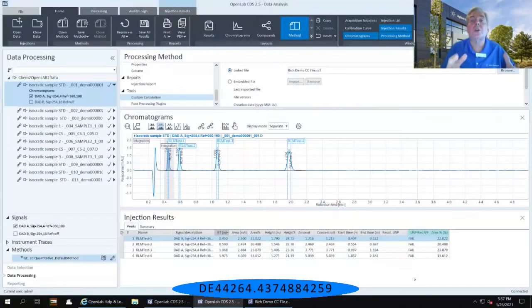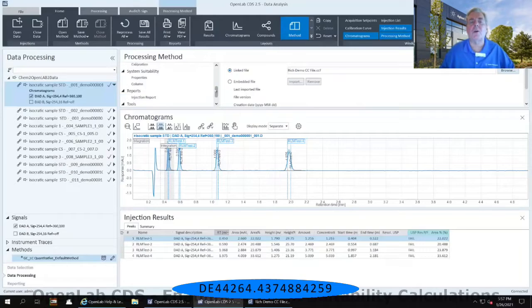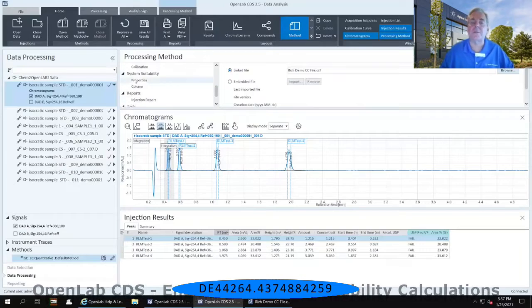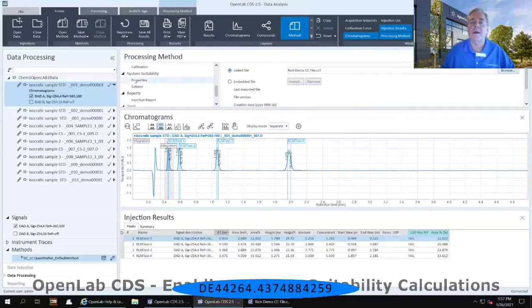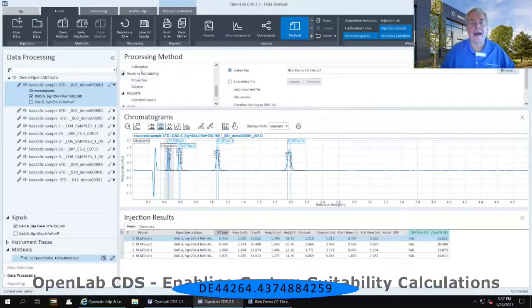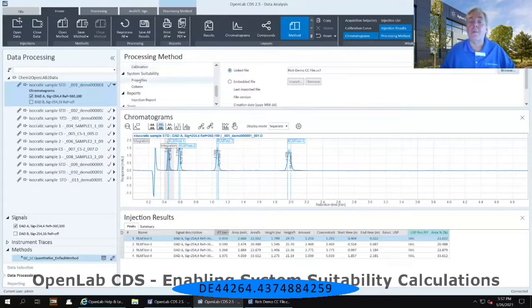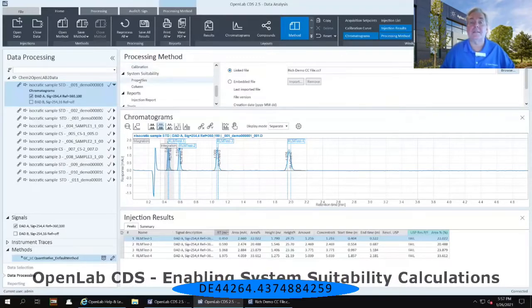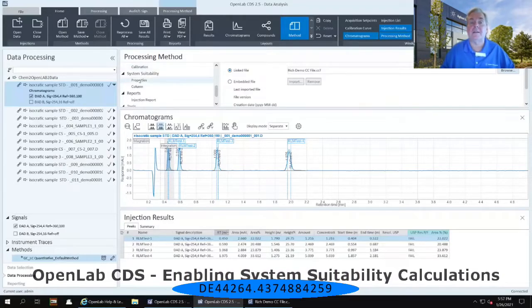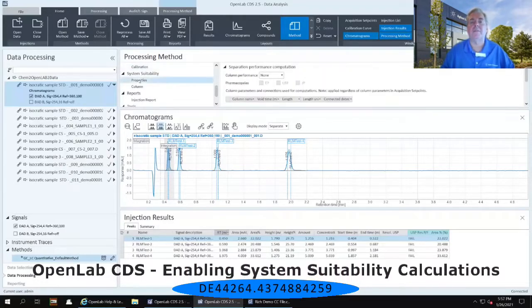In order to turn it on, in the processing method, use the scroll bar to go up just a little bit more, and you should see a section called System Suitability. Immediately below that, there is a Properties area. Select that Properties area.